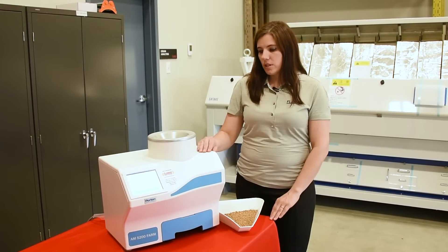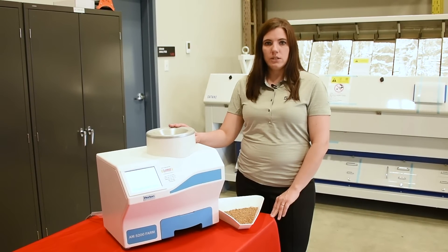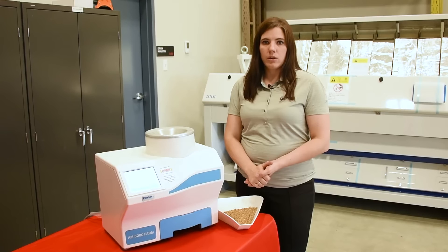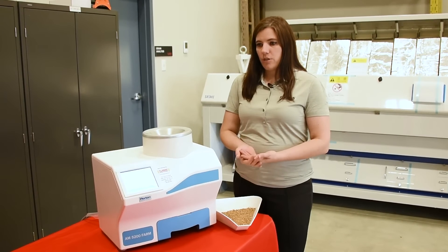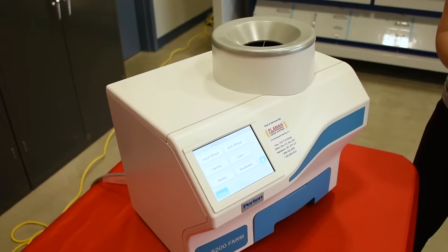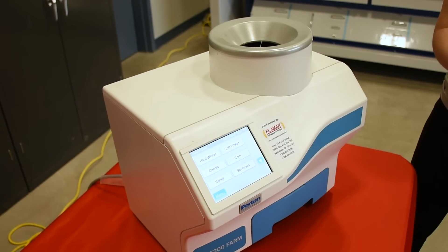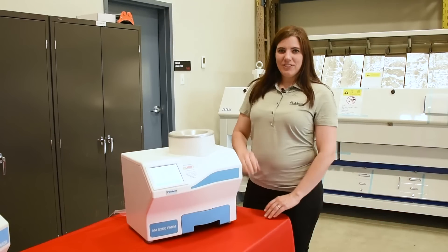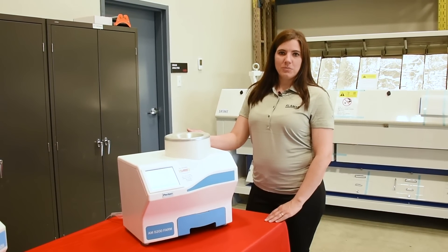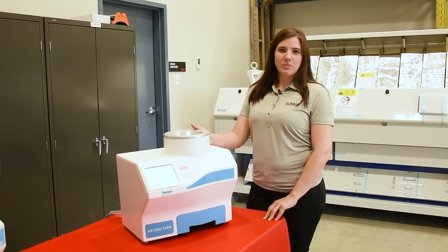So this meter is a good alternative to some of the old technology. It's really easy to use — there's no weighing or temperature adjustments needed. You don't need to use a thermometer or any kind of temperature gun. It has a large temperature probe which will take an even spread of a lot of grains to be quite accurate. If you have any questions about the moisture meters, be sure to give us a call at Flaman Grain Systems in Saskatoon and we'd be happy to help.